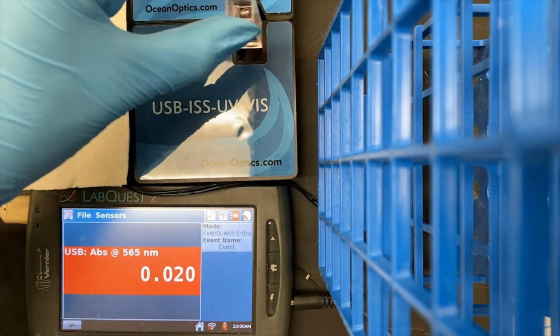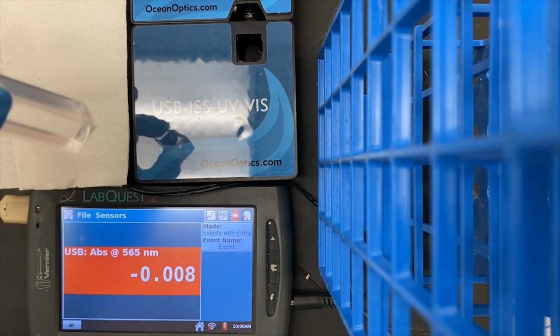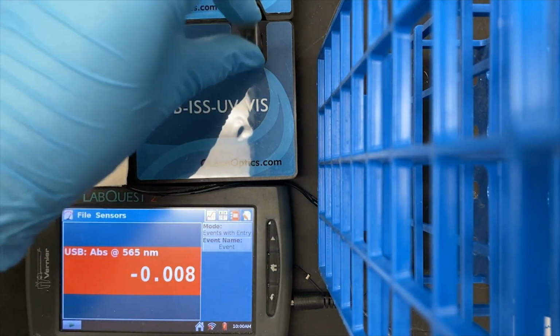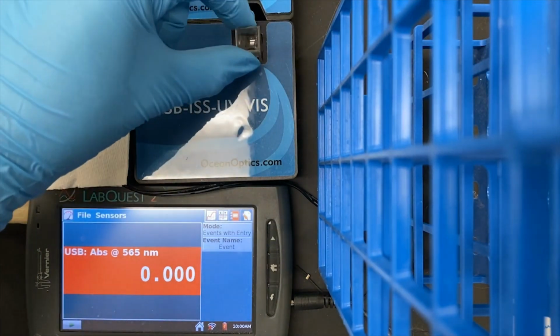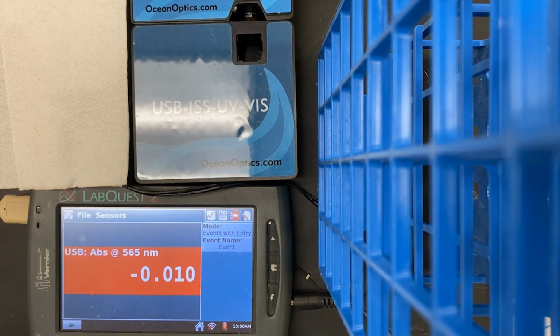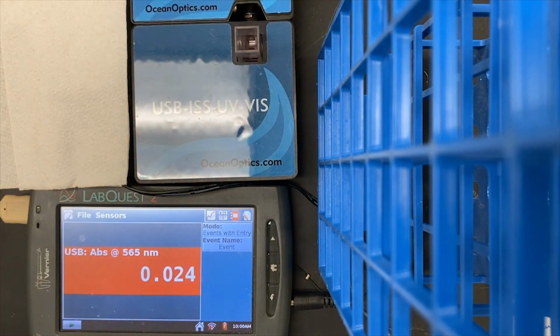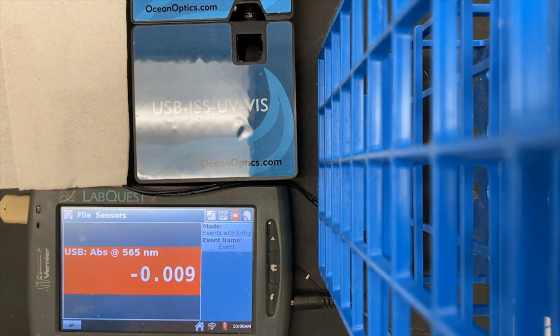And you'll be able to find the raw data on Blackboard for you to check. And you'll see me blank correcting in between each one. And if you forget to do it, that's okay. You can just blank correct and put your sample in again. Okay, and that just helps the machine get back everything.